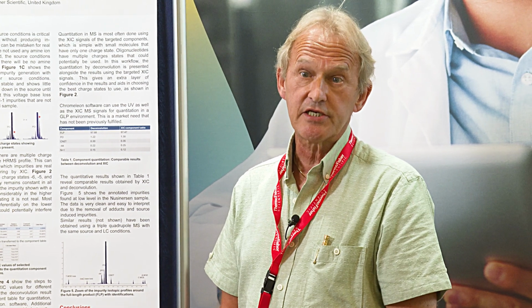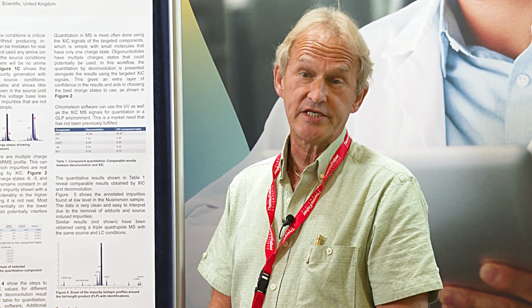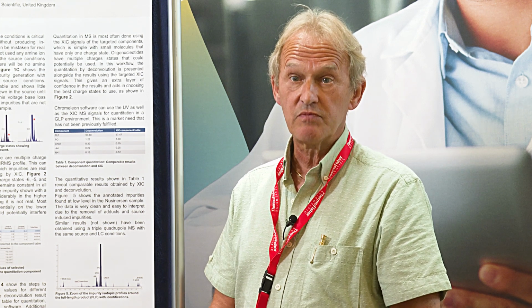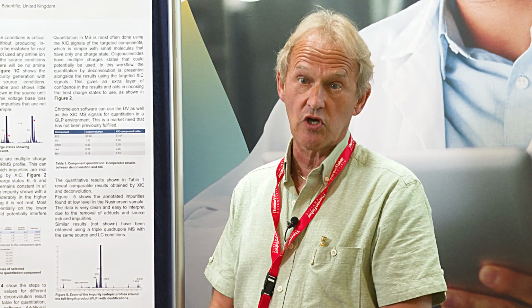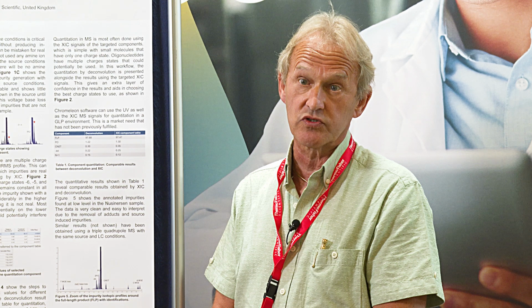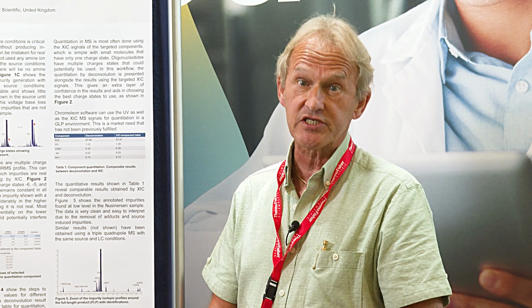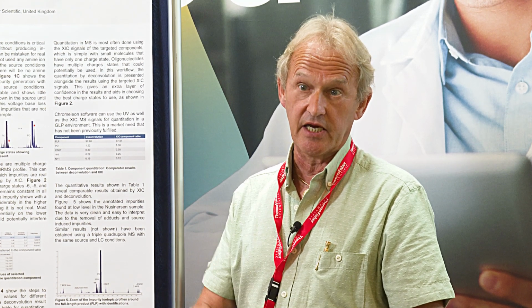Going forward, there's a lot of these new drugs in the analytical pipeline. There's also a lot in clinical trials. They all need new methods, and if these methods can be done without using the harmful solvents and the fluorinated compounds, it's going to make the world cleaner for when these medicines do come out. They're in SOPs, and this analysis is done again and again in the industry and in contract analysis labs.